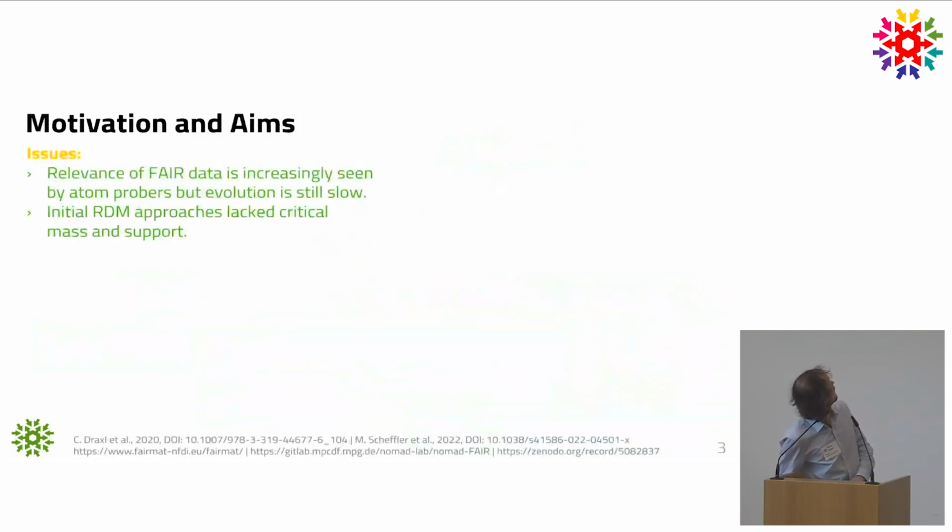Okay. What I want to do now is, what is the motivation and aim of specifically this topic and project on atom probe tomography that Christoph has already alluded to? What specifically are we doing? And then I want to immediately jump into concrete things and tasks that we have done for the community to help solve specific issues that are happening in the community.